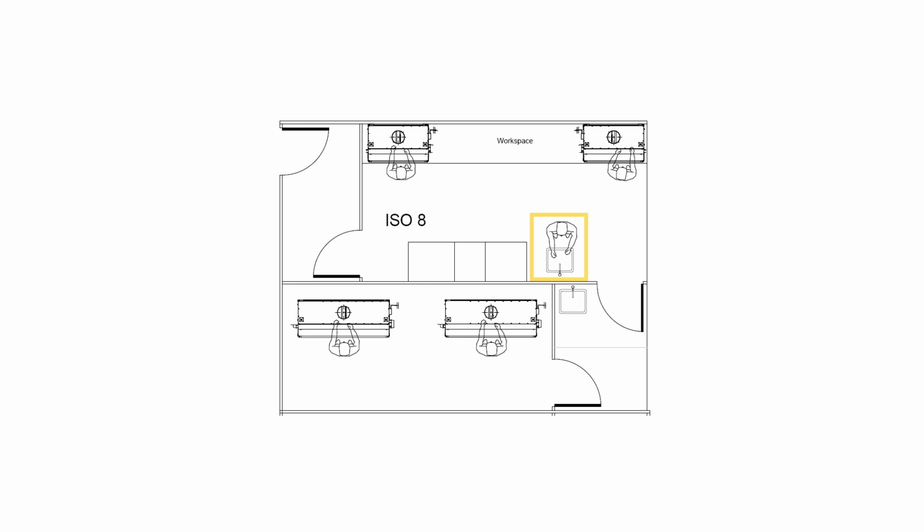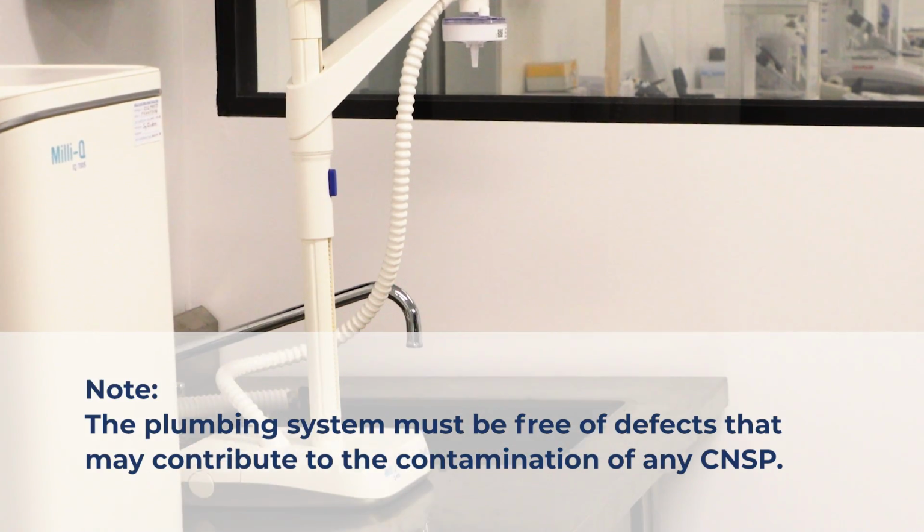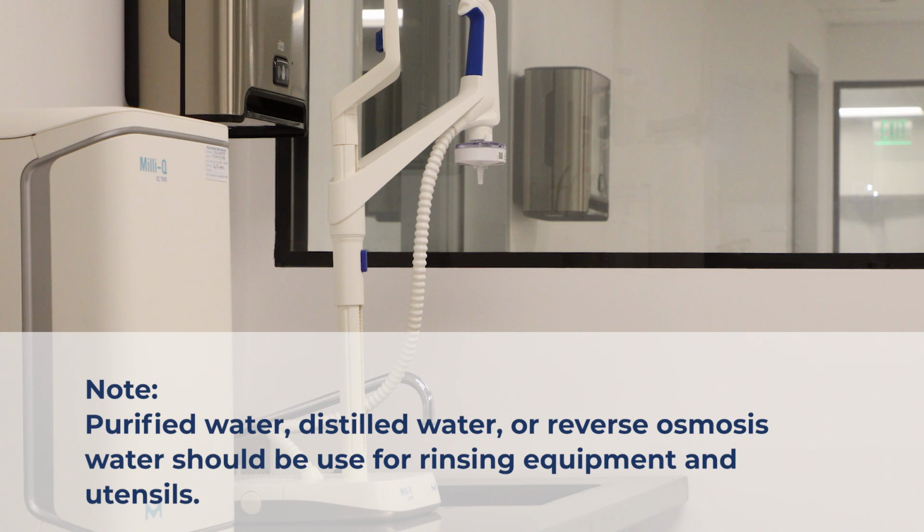A sink with hot and cold water sources must be accessible for hand and equipment washing. The sink must be cleaned and cleared of all non-compounding related equipment before washing the compounding equipment. Purified water should be used for rinsing equipment and utensils.